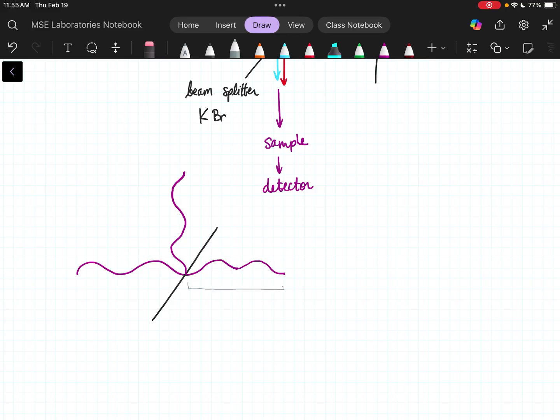If this travels, I have low, high, low, high, low. Let's see, this one travels the same distance: low, high, low, high, low. These two have now traveled the same distance. Good so far? Because there is more.